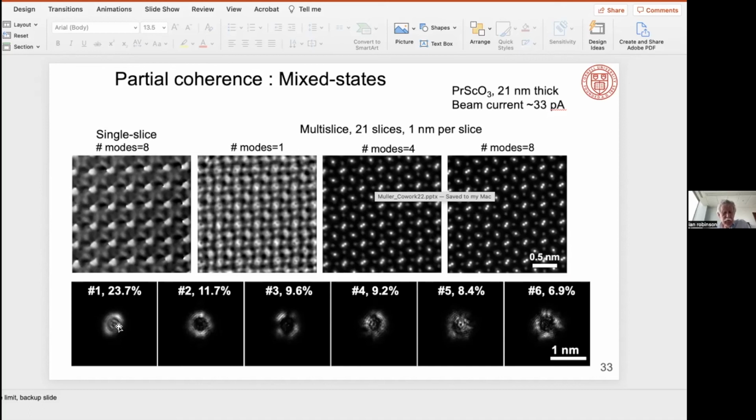Mm-hmm. And sorry to steal all the questions, but did the position correction, was that a make or break thing? Did you absolutely have to have that in order to get the ptychography working, or is it an add-on? It depends. Our first one on the MoS2 originally didn't have that. So, we had good data. We couldn't do position correction because it was in focus, but it was stable enough, it would run. And that reconstructed to 0.39 angstrom. So that was pretty good.